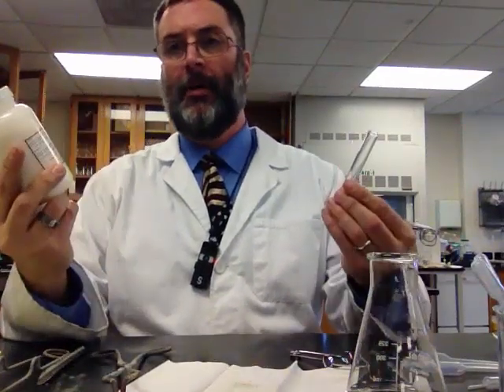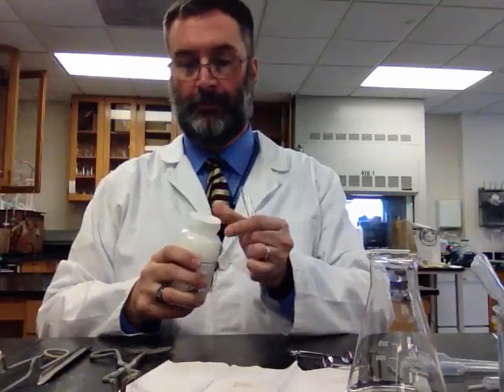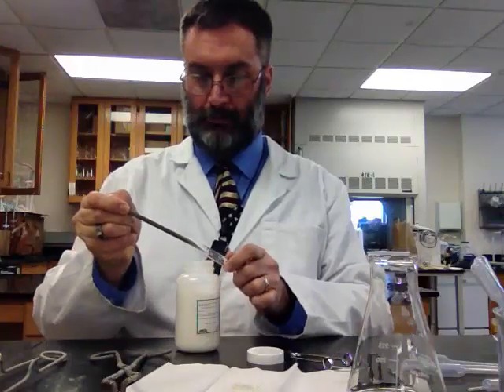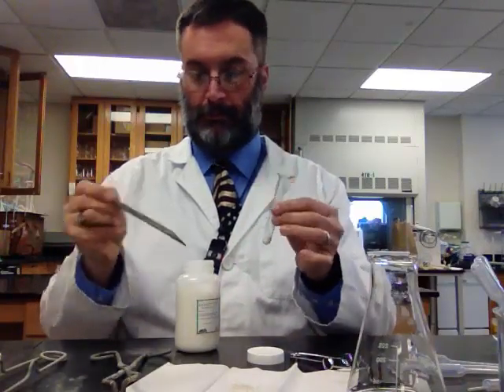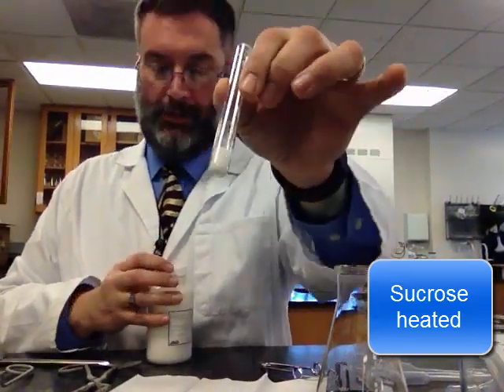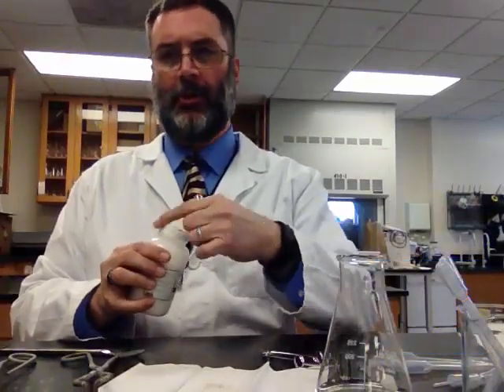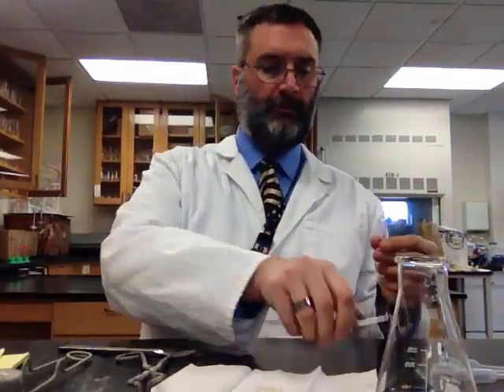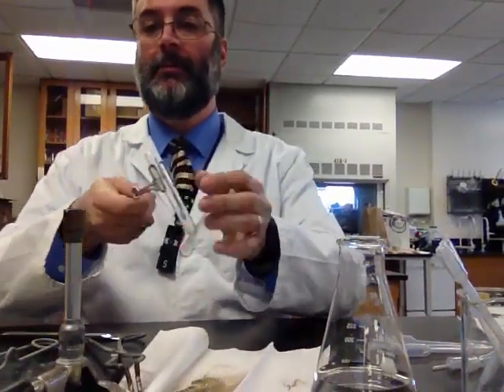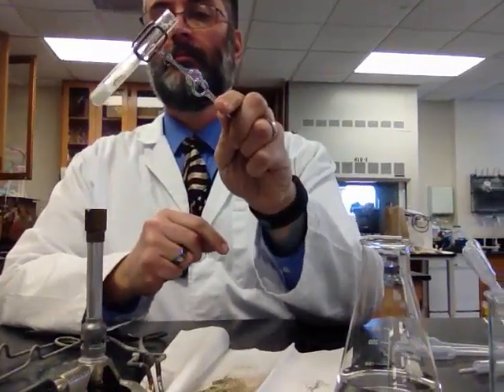Sucrose, commonly known as table sugar. White crystals in my test tube. You've seen sugar, you know what it is. I'm going to hold this over our Bunsen burner flame. Watch for changes. Do you see it changing?